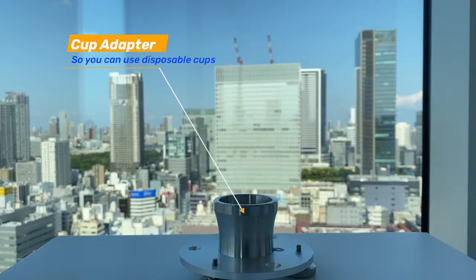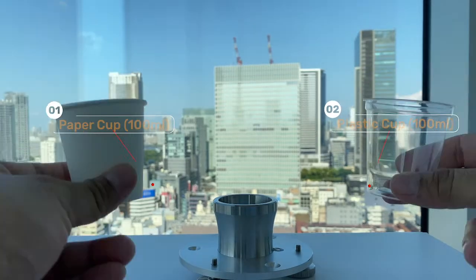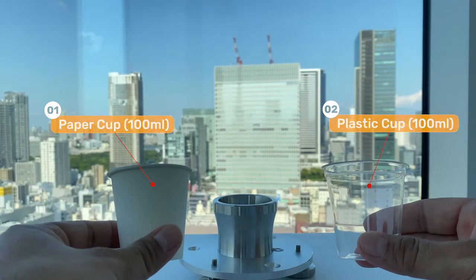The cup adapter was designed for when you have adhesive that will stick to glass or damage glass or start hardening when they come in contact with metal or glass. You can use disposable cups like paper cups or plastic cups, and this cup adapter will hold it in place while you measure the viscosity of it.